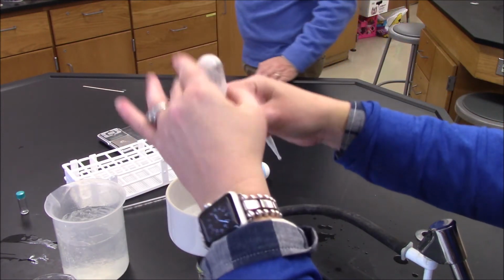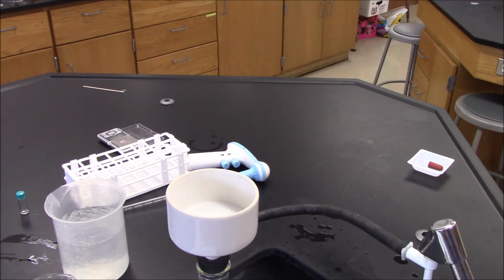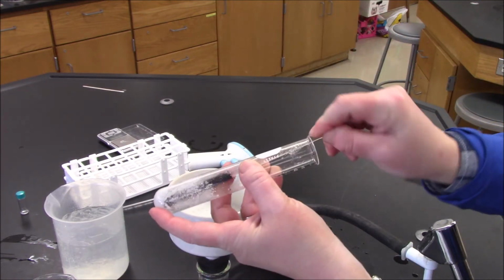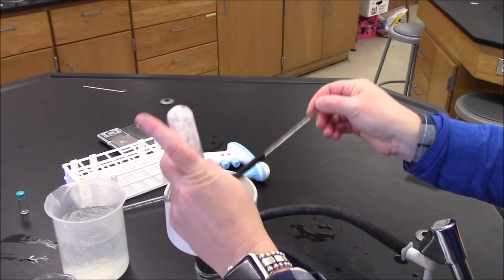I'm not really getting them to come out here. I'm going to try to use my old friend here, the rubber policeman, to get this out.